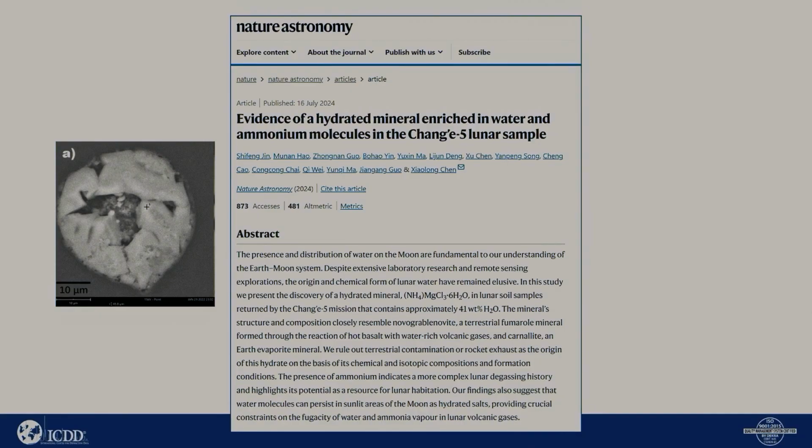This is one of those cases where they've got the apparatus and they had to figure out for 6 months how to get it open and get the sample out, etc. Okay. But ultimately, the data were collected, and what was unusual was the claim that this material coming from the moon had water, okay, as part of the lattice.